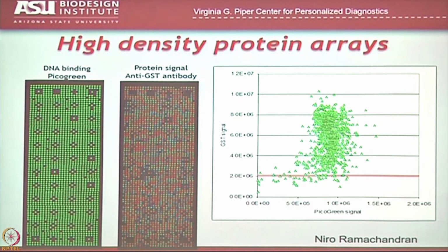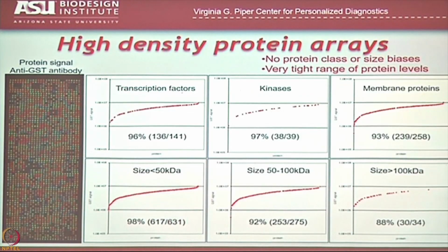And just to give you some better sense of that, here's quantification based on different types of proteins, going from weakest to strongest. This line here represents the lower end of detection, and this is the higher end of detection.